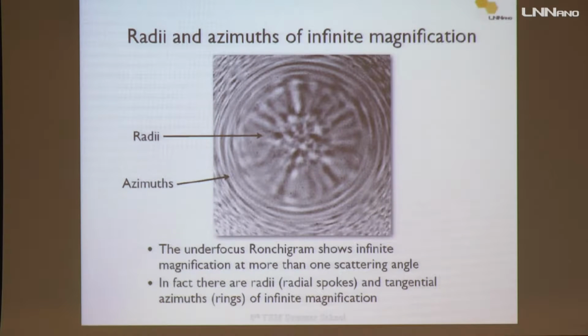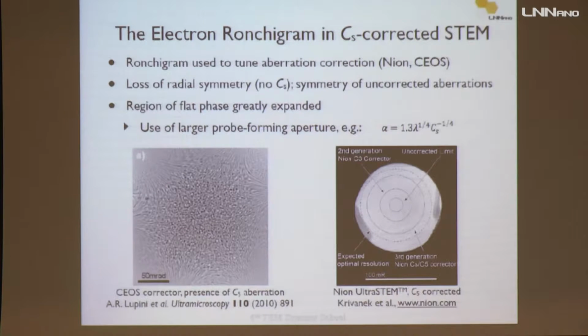All of these are related with first order, second order, third order aberrations of your lenses. And then people are working in the development of the correctors, okay? And what they get nowadays is something like this. It's not that visible here, but here you can see this C5 aberration corrector, okay? You have a very large area without any distortion, okay?